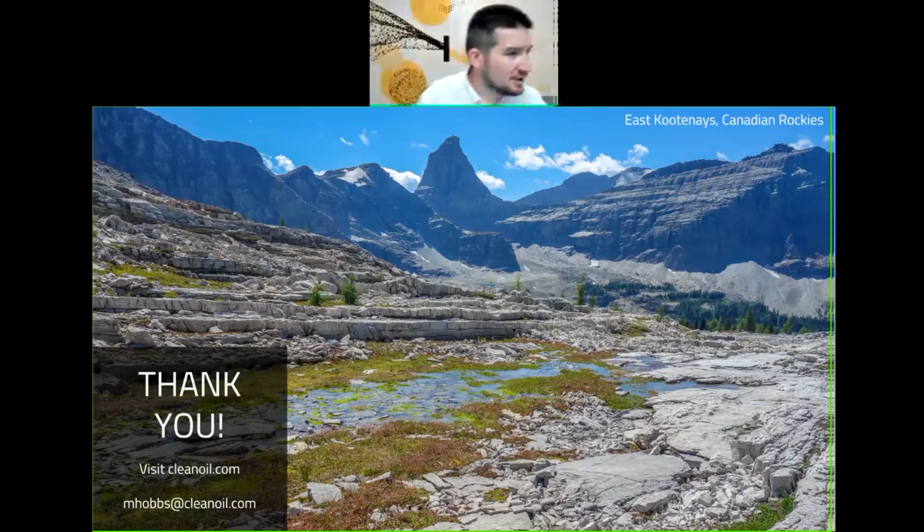Seeing another question from a different Ken. Sorry, the chat just moved on me as somebody else came in there. MPC test measures soluble and insoluble varnish, correct?